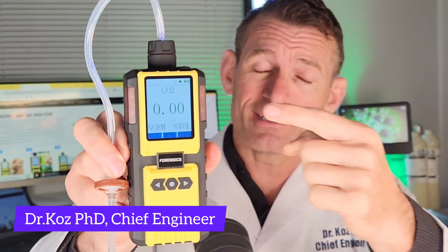Carbon dioxide — look at the large digits: 0 to 100% of CO2. You may be in the business of packaging fruit, dairy, and you are using carbon dioxide to flush and create an inert environment so your product can have a longer shelf life. But when you're packing, you want to make sure that it's actually being flushed, and the only way to do that is with a headspace analyzer just like this one.